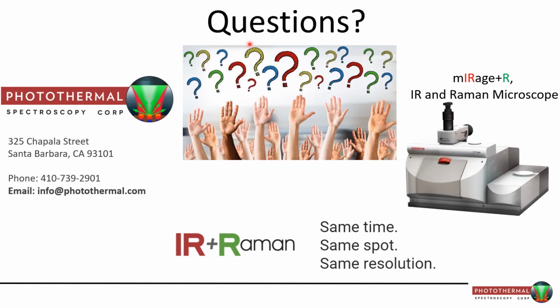Great. Another question here, and Andy, if you don't mind, I may take this one myself. The question is, what about colored particles, and does the green affect them? Let me answer this in a general sense. How do we handle colored materials? If there's color, it can be associated with fluorescence. I'll stress again that the O-PTIR channel is completely unaffected by fluorescence. If fluorescence is there, it will certainly impact the Raman, but not the infrared.